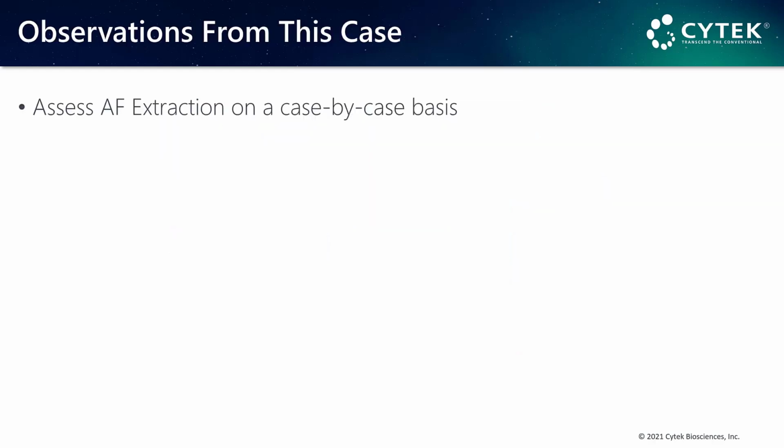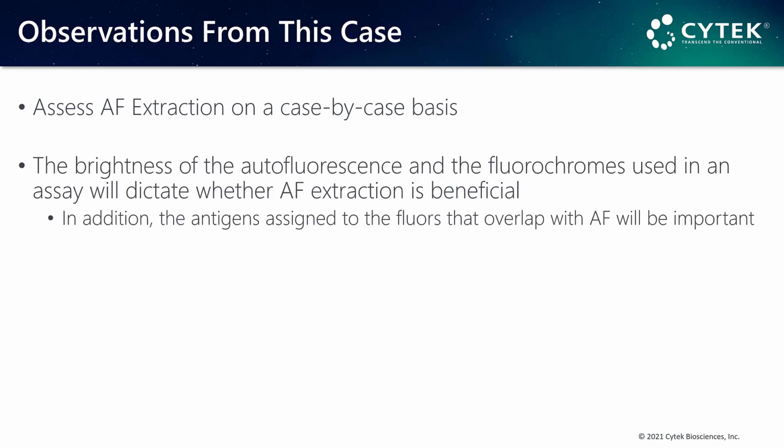At the end of the day, what we learn from this case is that it is important to assess autofluorescence extraction on a case-by-case basis. The brightness of the autofluorescence and the fluorochromes that you use in your assay are going to dictate whether or not that autofluorescence extraction is beneficial.